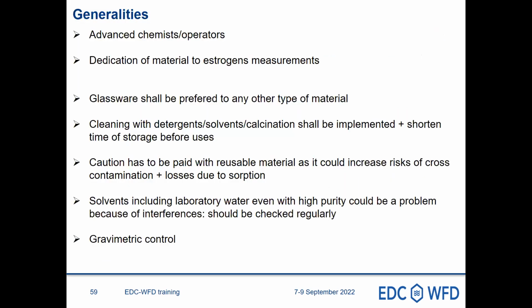Some general remarks. You really need advanced chemists and operators if you want to have these measurements under control. You possibly need to dedicate material to estrogen measurements, including the instrumentation. We have had some bad experience in the project when switching the instrumentation to other thematics. When you come back, you really have to do a strong cleaning to recover the initial performances. So yes, it could imply dedicating systems for these measurements.